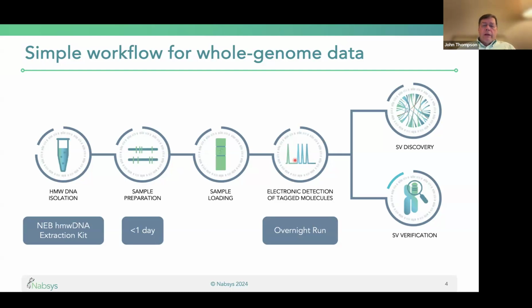The molecules are then either, if you're trying to assemble the whole genome, you take them, you map them against each other. This is a reference-free alignment so that you align all the molecules and get contigs, and then those contigs are applied to the genome that you want. You can use any reference genome you want, again, because the assembly is reference-free. Most people right now use HG38, but you can also use T2T or hg19 or whatever you like. And that will give you novel structural variants of sizes from 300 bases on up.